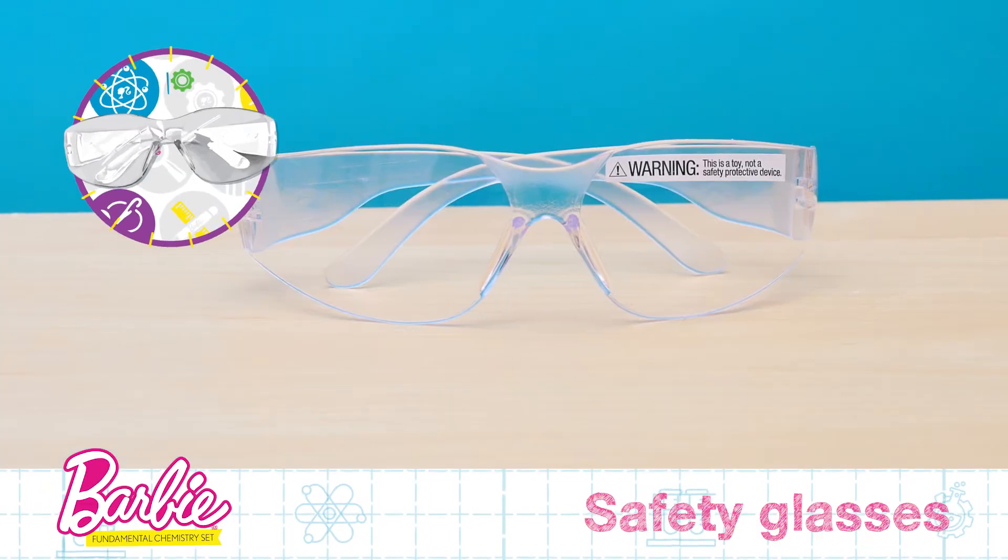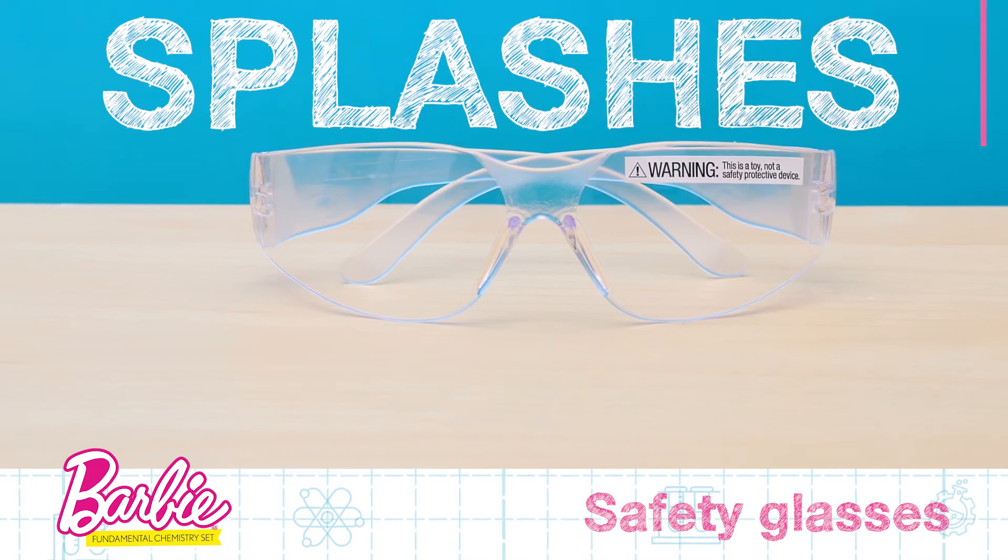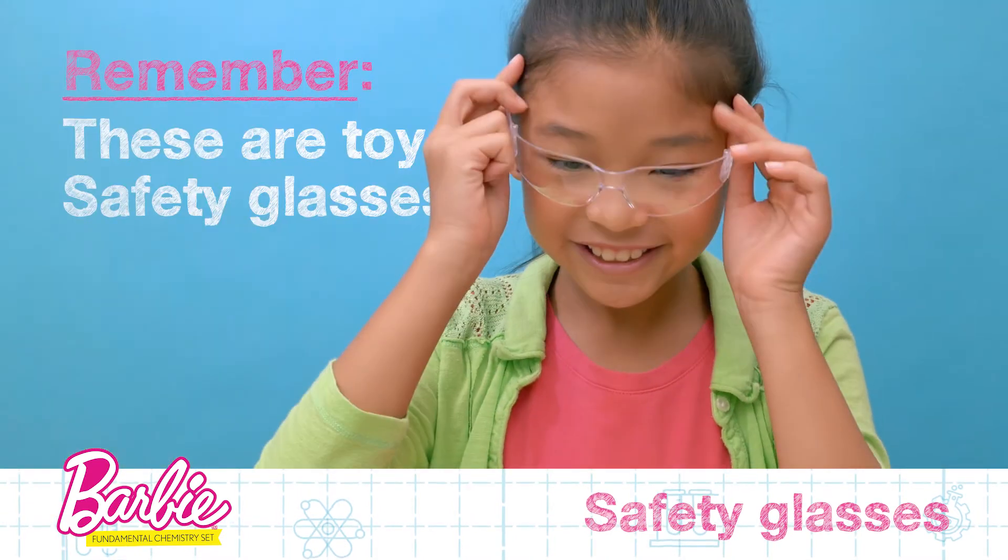Finally, we have the safety glasses. Safety glasses protect your eyes from splashes and particles in the air. Remember, these are toy safety glasses.